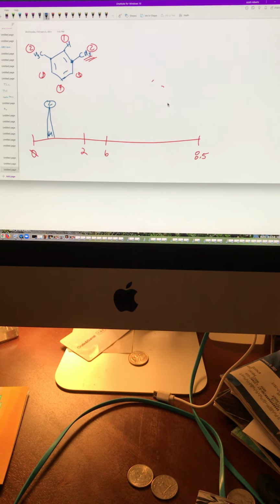Okay, now listen. Our groups are not electronegative. They're electropositive, so they don't pull electrons, they push. That is a major premise. Our groups are EDGs, not EWGs: electron donating groups. Why 6 hydrogens? 3 and 3. Signal 2 has 6 total hydrogens. So our groups are electron donating groups, better known as pushers. And if they're pushers, they're shielders. So who has the most shielding: 1, 3, or 4? Come on, folks, pay attention. 1. So who's closest to 0? 1, 3, or 4?